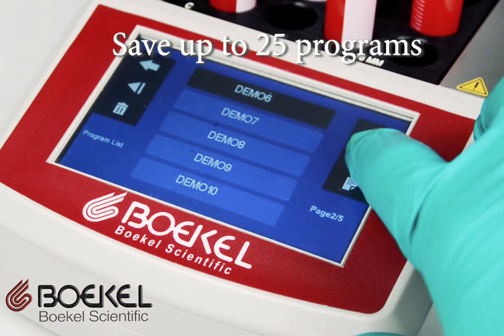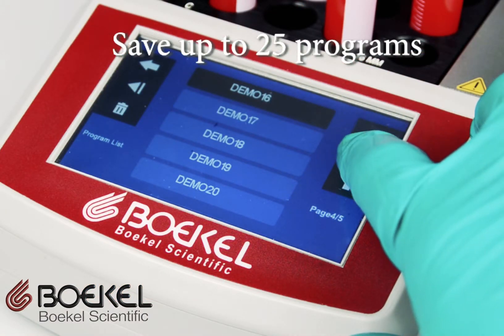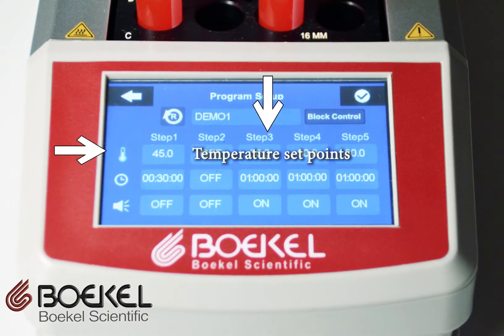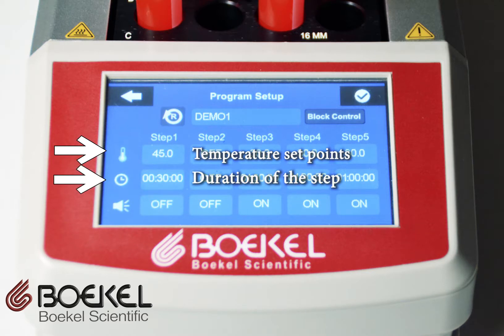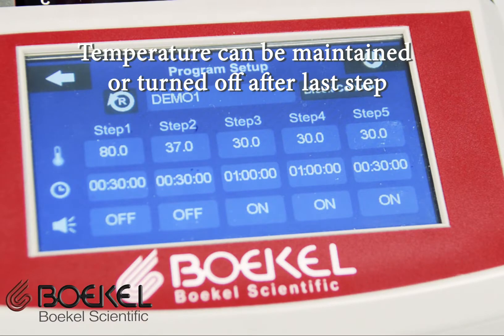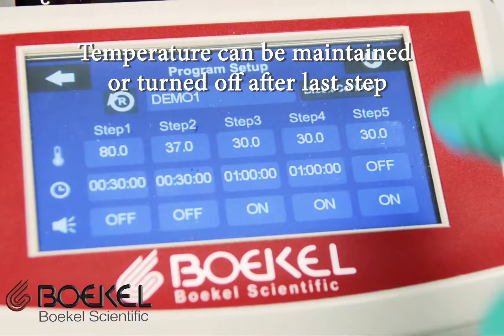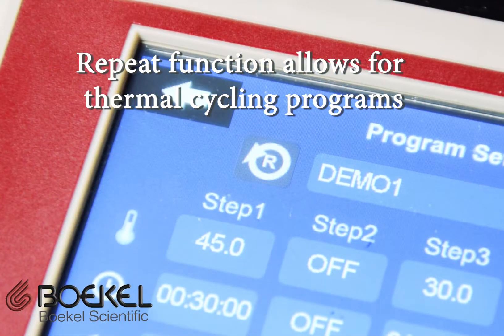The unit can save up to 25 user-configured programs. Each program can have up to 5 temperature set points with the ability to control the duration of the step and set an alarm after the step is complete. The unit can turn off the heat or maintain the temperature indefinitely after the last step. With the repeat function, the unit will step through the steps over and over to create a thermal cycling process.